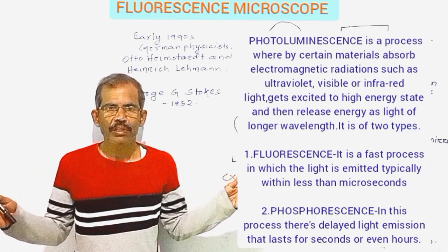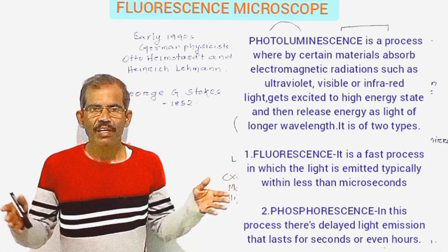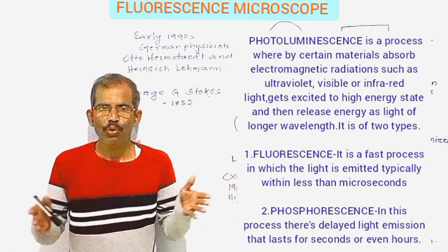The difference between the wavelength at which these materials are excited and the wavelength at which they emit light is known as Stokes shift.